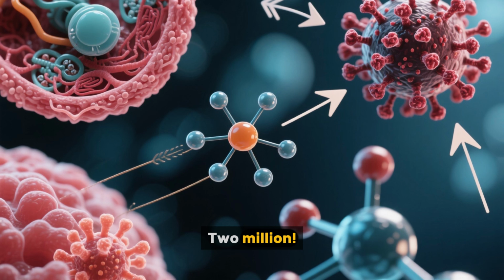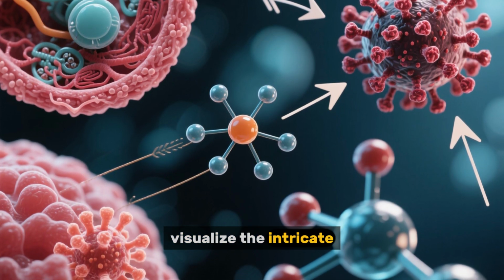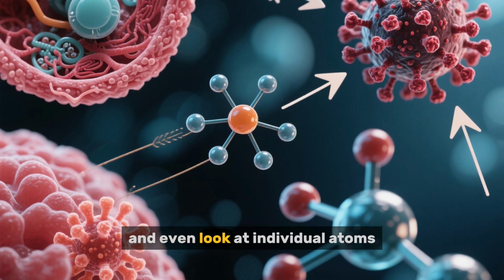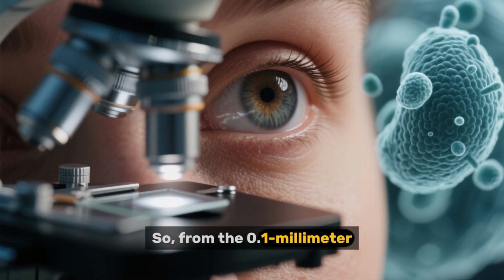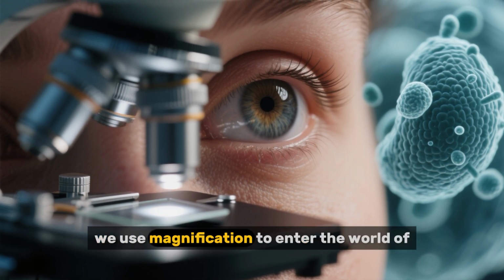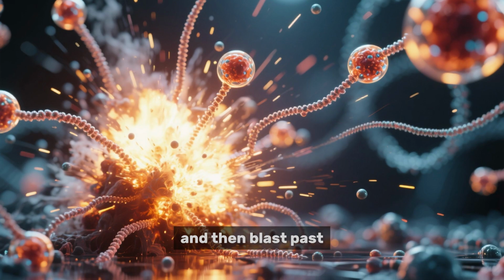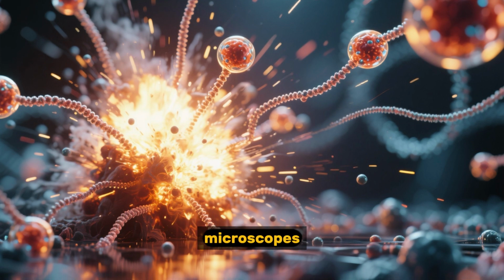2 million. This is how scientists can visualize the intricate, tiny machinery inside our cells, study the structure of viruses, and even look at individual atoms. So, from the 0.1 millimeter limit of our eyes, we use magnification to enter the world of micrometers with light microscopes, and then blast past that into the nanometer realm with electron microscopes.